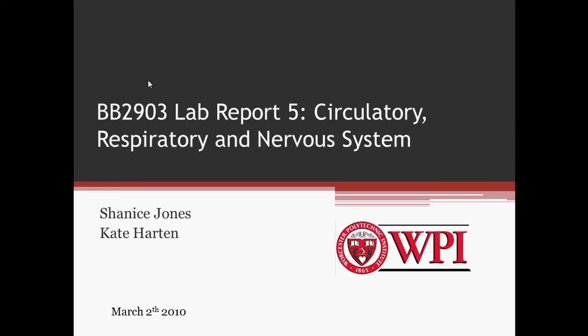In this week's lab, we examined the respiratory, circulatory, and nervous system of the pig. We also examined the amount of carbon dioxide in one's breath in comparison to room air concentration. Also, the effect of exercise on carbon dioxide production was observed, and we measured the vital capacity within our section in our class.